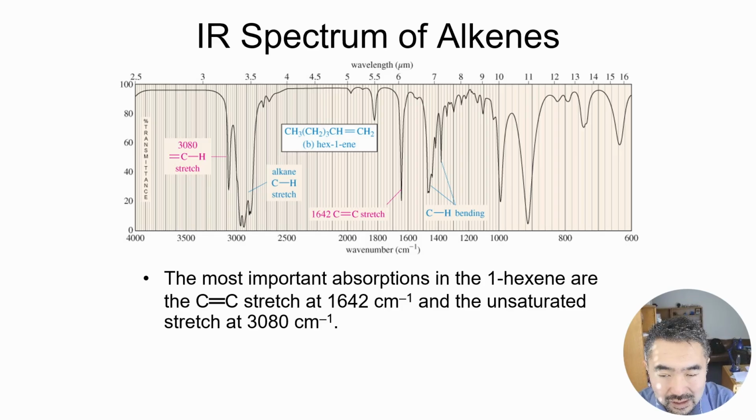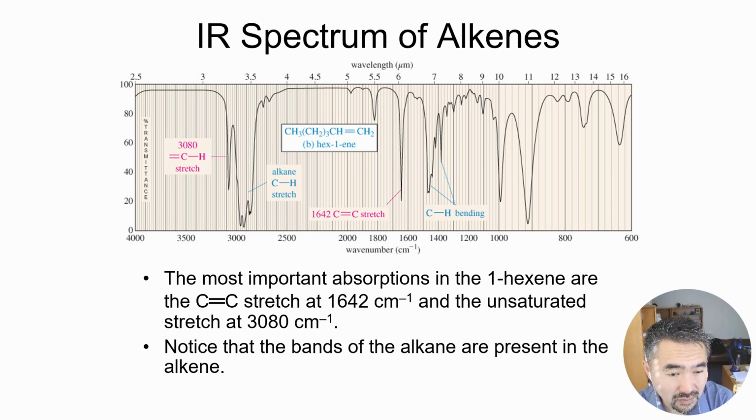Now this band or peak is pretty prominent. Often it's pretty tiny, like this big. So just be aware of that. Of course, we see the carbon-carbon double bond stretch, which is right at the cutoff for the fingerprint region here. And actually, I'm not really sure what this band is, and sometimes you do see some unexplainable peaks in a real-life spectrum just because of background noise, right?